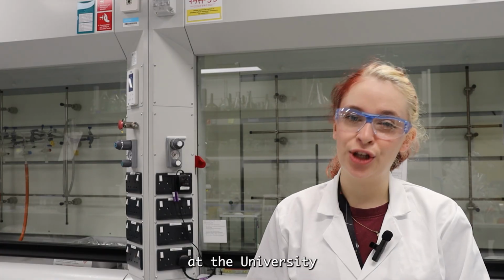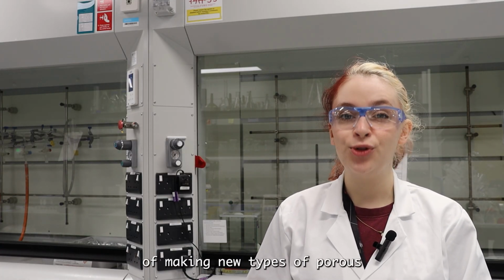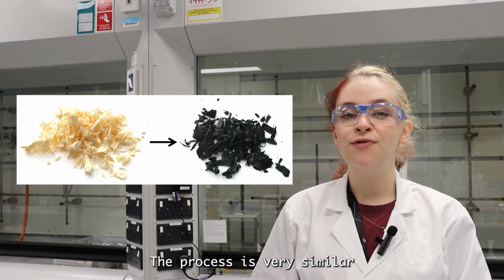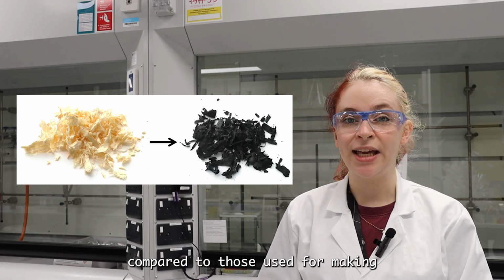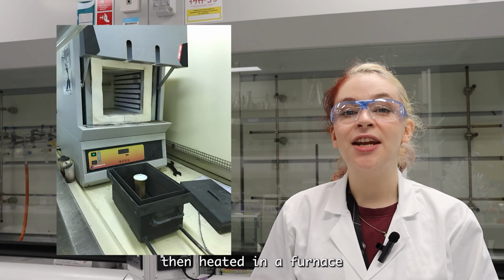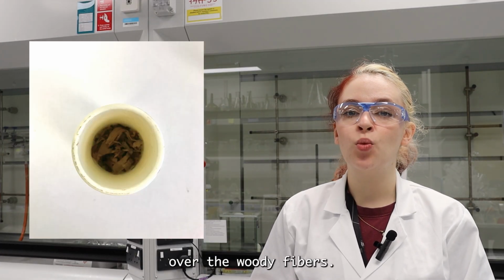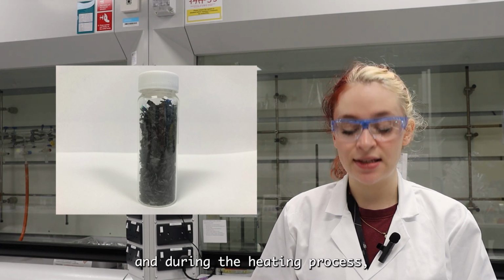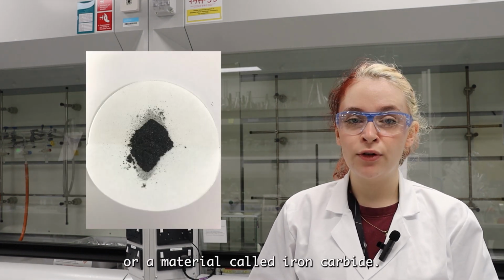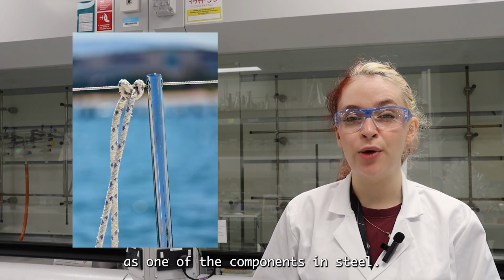In the School of Chemistry at the University of Birmingham, researchers working with Zoe Schnepp have been developing ways of making new types of porous carbon from waste materials such as sawdust. The process is very similar to those used for making activated carbons. Sawdust is mixed with a solution of iron nitrate and then heated in a furnace in an air-free environment. The iron is dispersed over the woody fibres, and during the heating process, the iron compounds break down to form nanoparticles of a material called iron carbide. This is perhaps more familiar as one of the components in steel.